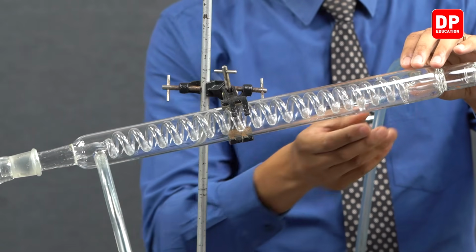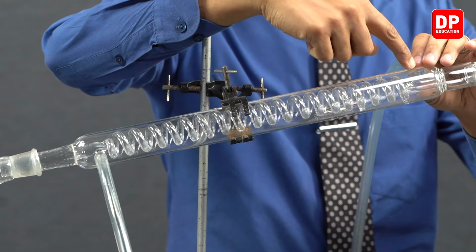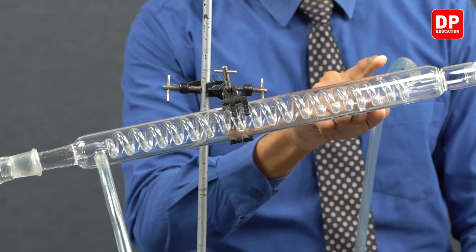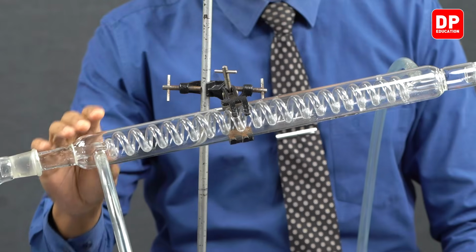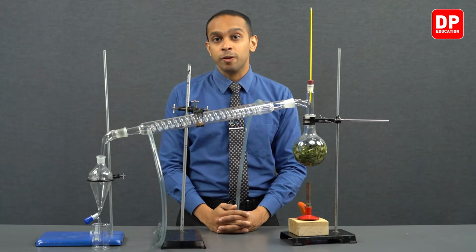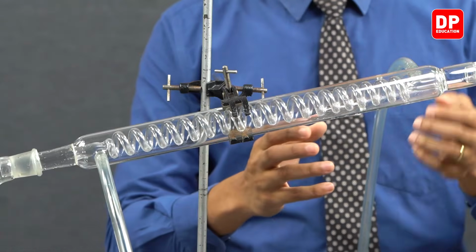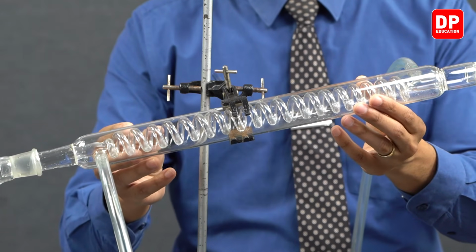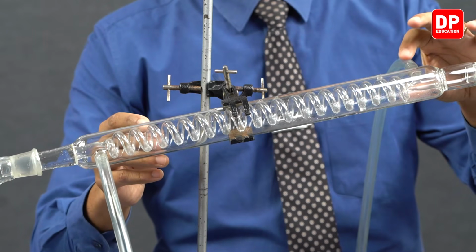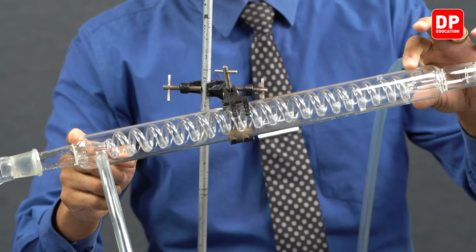Over here, we can see when water is moving from the bottom of the condenser all the way to the top of the condenser, water is moving opposite to the direction that the vapor will be moving. This ensures that the vapor is always in contact with cold water, which maximizes the heat transfer. So this allows the vapor to cool down and turn into a liquid as the vapor mixture travels from the top of the condenser to the bottom of the condenser.